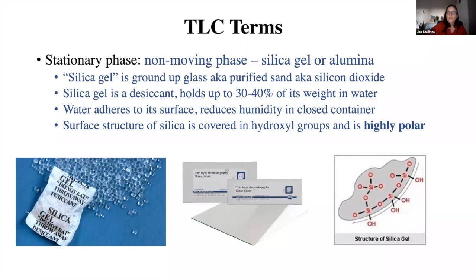All right, so these are the terms that you're going to hear in the JoVE video. So, stationary phase. Stationary means it's not moving, it's just standing still. That's going to be your TLC plate, because your TLC plate during TLC doesn't go anywhere, it just remains where it is. So we think of that as stationary, like a stationary bike. It's just sitting there, it's doing work, but it's not going anywhere.